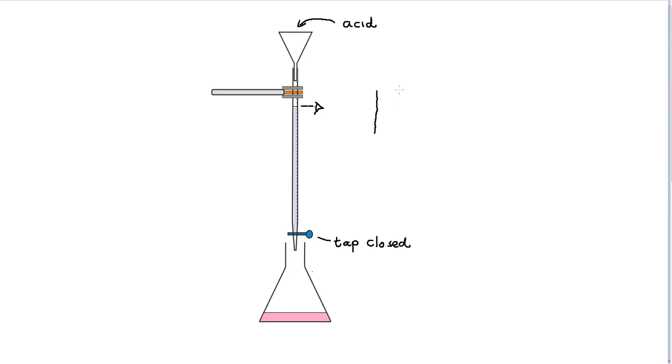That's the burette column, that's the meniscus, and we're going to measure there - the bottom of the meniscus - because that's easiest to read. We're going to take a note of that value and write that down in our notebook.